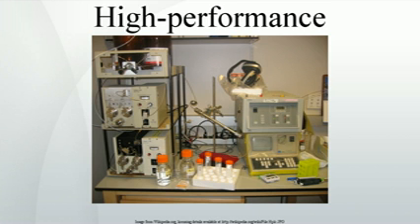The polar analytes diffuse into a stationary water layer associated with the polar stationary phase and are thus retained. The stronger the interactions between the polar analyte and the polar stationary phase, relative to the mobile phase, the longer the elution time. The interaction strength depends on the functional groups part of the analyte molecular structure, with more polarized groups, for example hydroxyl, and groups capable of hydrogen bonding inducing more retention. Coulombic, electrostatic, interactions can also increase retention.